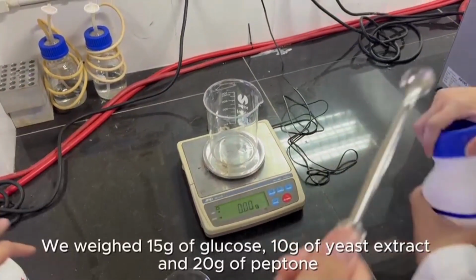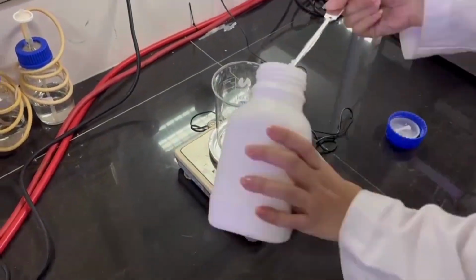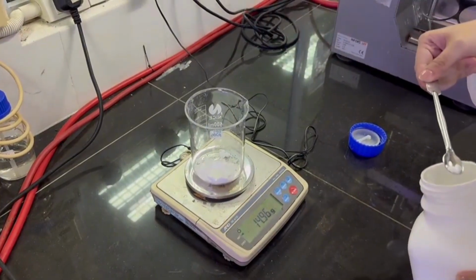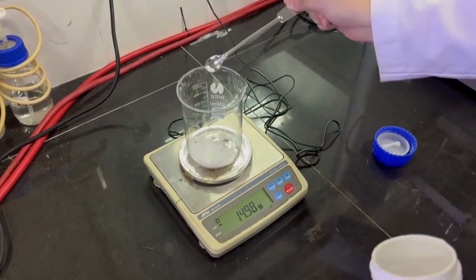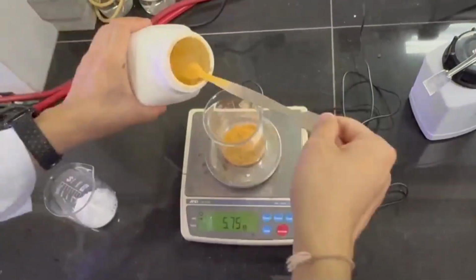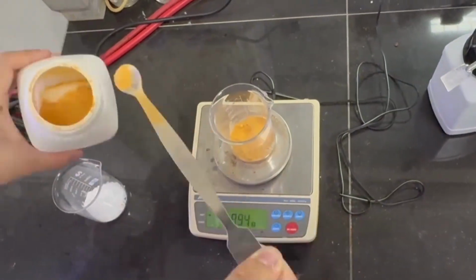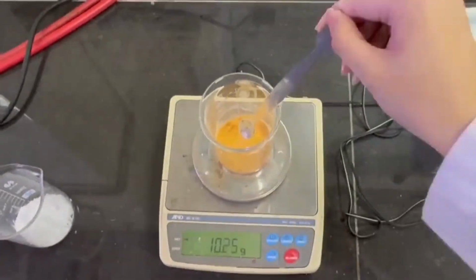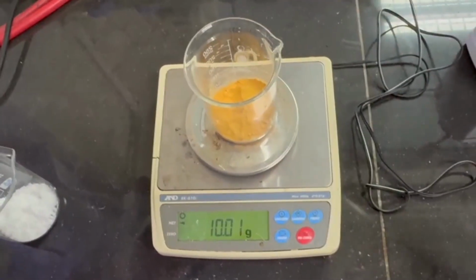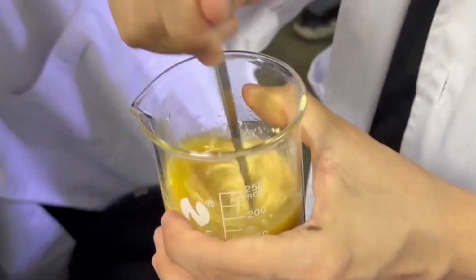We weigh 15 grams of glucose, 10 grams of yeast extract, and 20 grams of peptone, and mix them together with distilled water up to 1 liter. The mixing process was done twice.